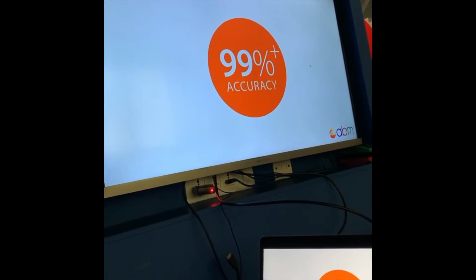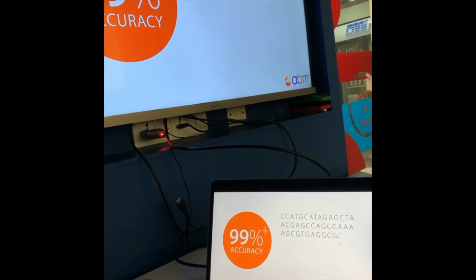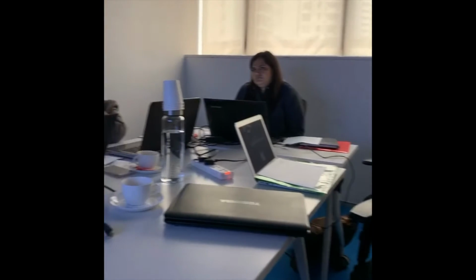While specific platforms available on the market are very accurate, they are still prone to error. Even at accuracies of 99% and greater, a sequence generated may contain incorrect nucleotides. This means that if a machine's accuracy is 99%, 1 base pair is read incorrectly out of 100. Since NGS platforms generate high amounts of output, these errors can add up quickly. The way to circumvent NGS platform limitations is to sequence nucleotides multiple times. The number of times a nucleotide is sequenced is referred to as coverage or depth.